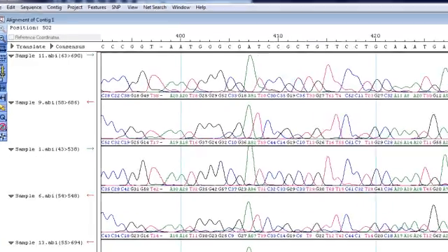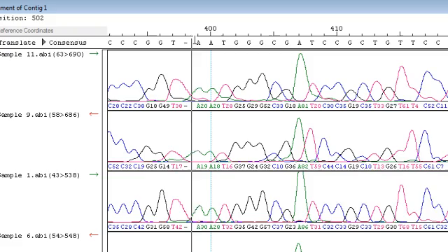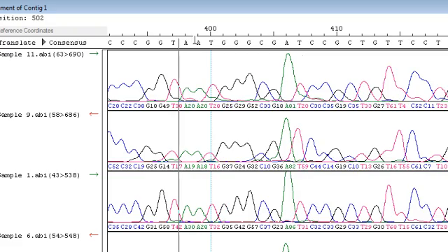After viewing trace data and quality scores, you may wish to edit your consensus. For example, if I want to remove this gap, I simply click in the consensus area and hit the Backspace key.